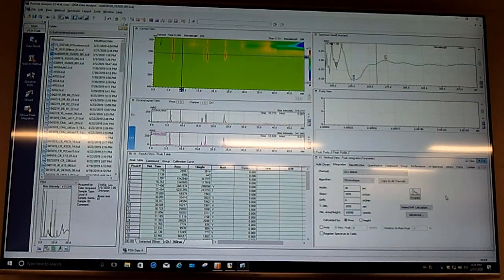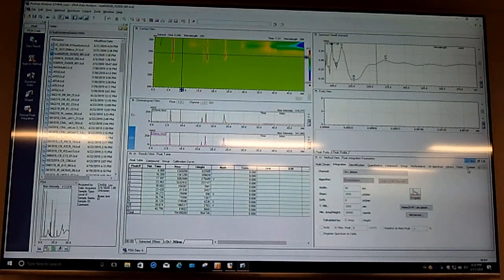Once you finish inputting everything, make sure you click on the view button. That shows you the result after we change these two parameters. It looks like much fewer peaks, but not good enough. So you can continue adjusting the width and also the minimum area and height. Another way to do it is manually. To do it manually, we still click on edit and click on the program.